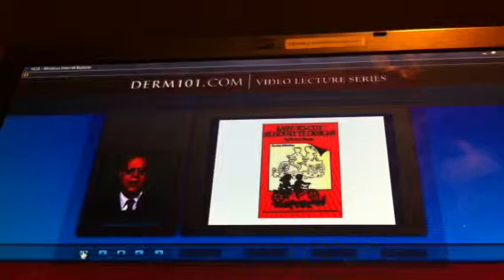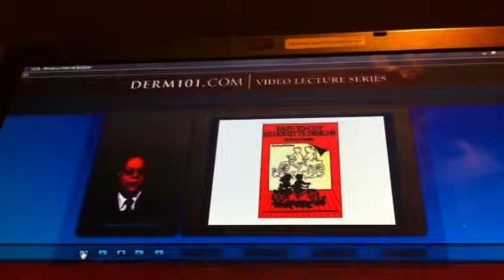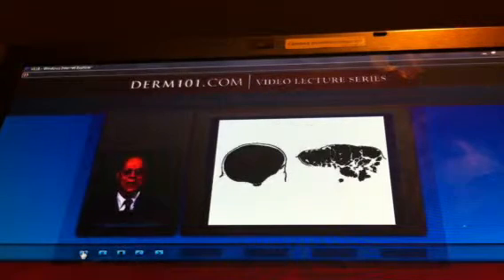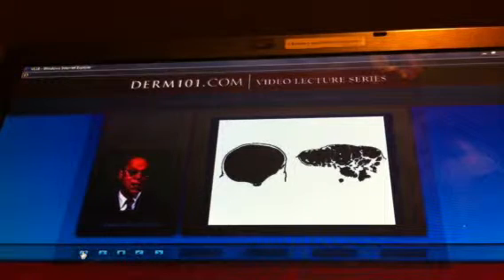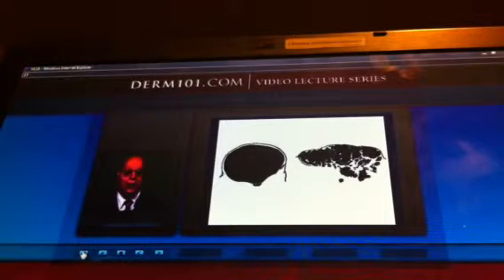Even children are able to recognize objects by silhouette. For example, they can tell the difference between a boy and a girl — girls have long hair — and they can recognize all of these structures. If children can do it, so too can histopathologists. On the left is a benign neoplasm; on the right, a malignant neoplasm. And that can be determined by silhouette alone.